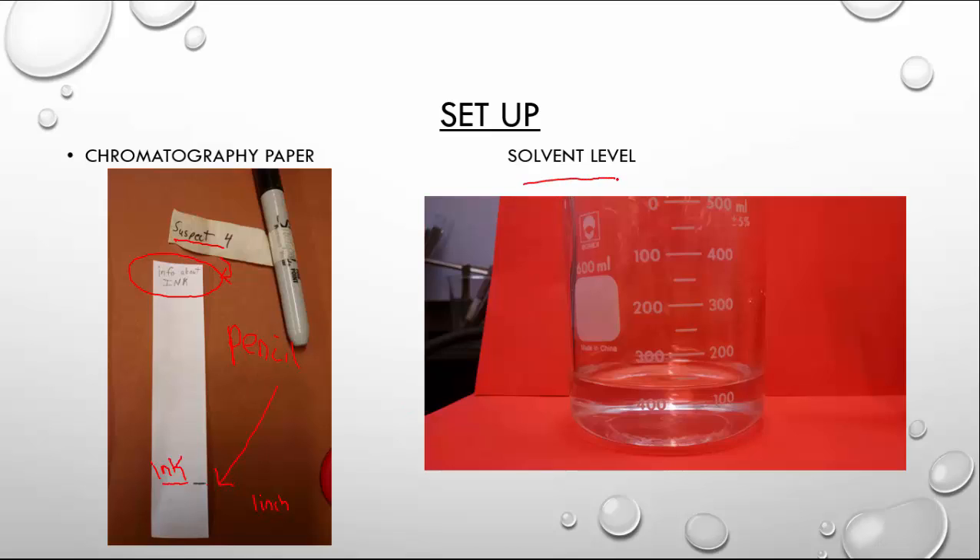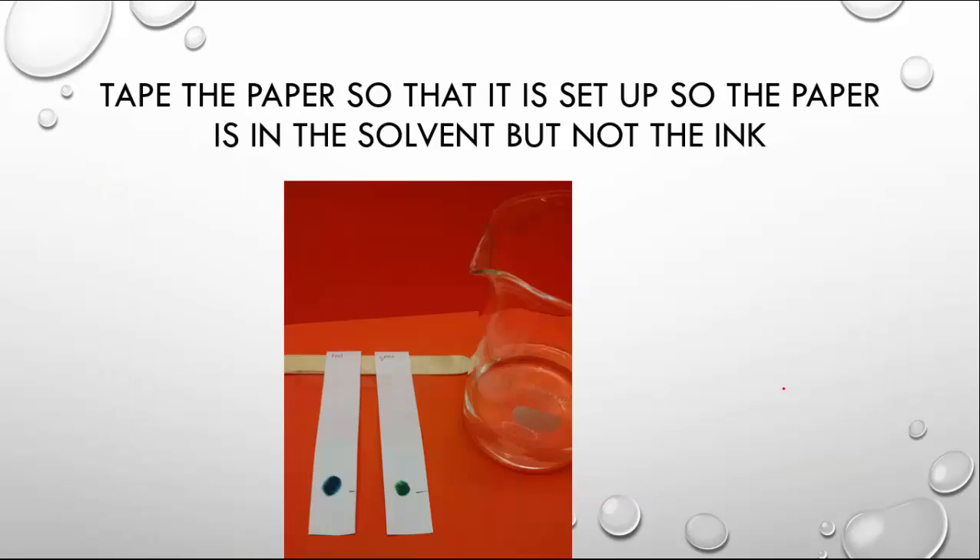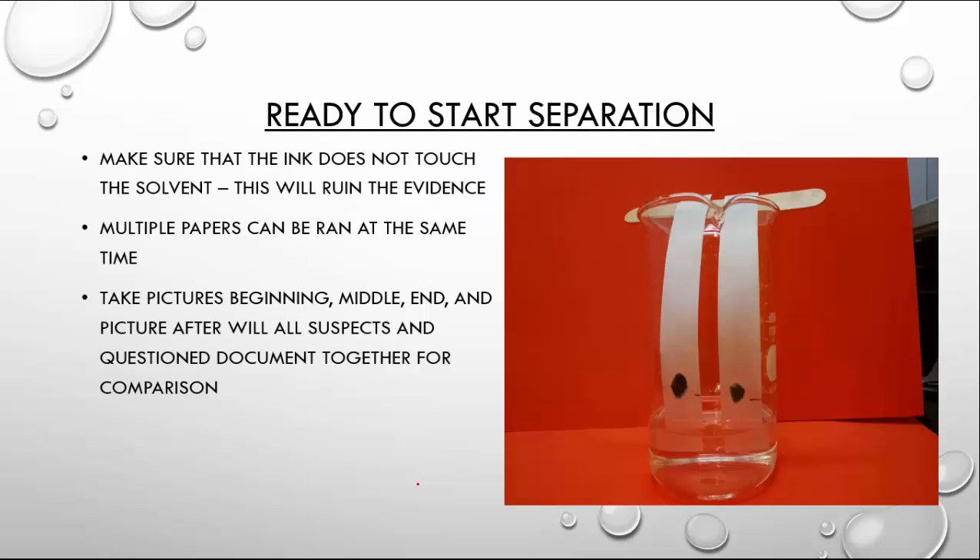The second part is solvent level. Whatever solvent we're using — water and something else — is going to be about 100 to 150 milliliters down at the bottom. The key part is to tape the paper so that the paper is in the solvent but the ink is not. You're going to tape it here so that when we put it into the beaker, the water or solution level is here but the ink is above the water level. That solvent level should stay below the ink.